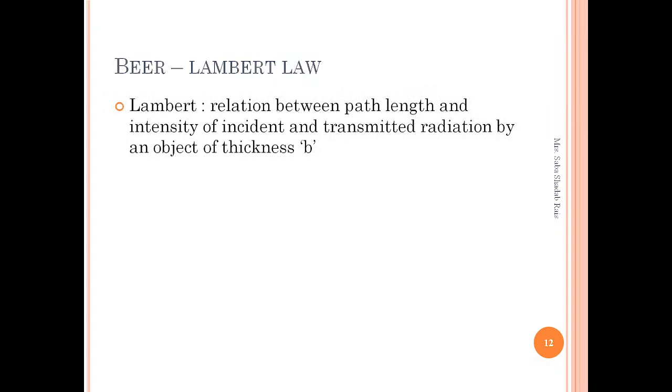Now this colorimeter basically works on the Beer and Lambert law. What is this Beer and Lambert law? It is important: if it is asked to write the principle and application of the colorimeter, it is really important for you students, from the exam point of view, to write about the Beer and Lambert law. So Lambert studied the relation between the path length and the intensity of the incident and transmitted radiation by an object of thickness.